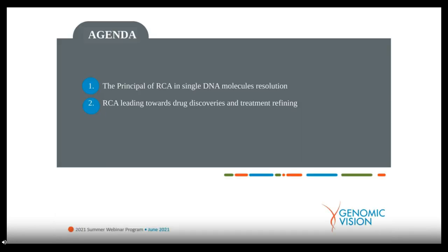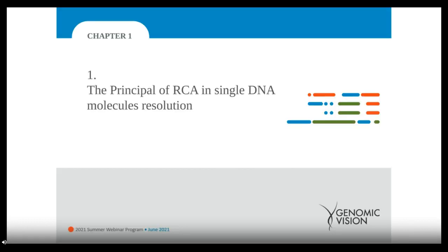So indeed, the agenda of today is divided into two parts. The first part is going to be based on the principle of our replication combing assay in our molecular combing technology. And the second part is to walk you through the use of our RCA and single DNA molecule technology for drug discoveries, screening, and then at the end for treatment refining. But now let's start immediately and go to the principles leading the RCA at single DNA molecule resolution.